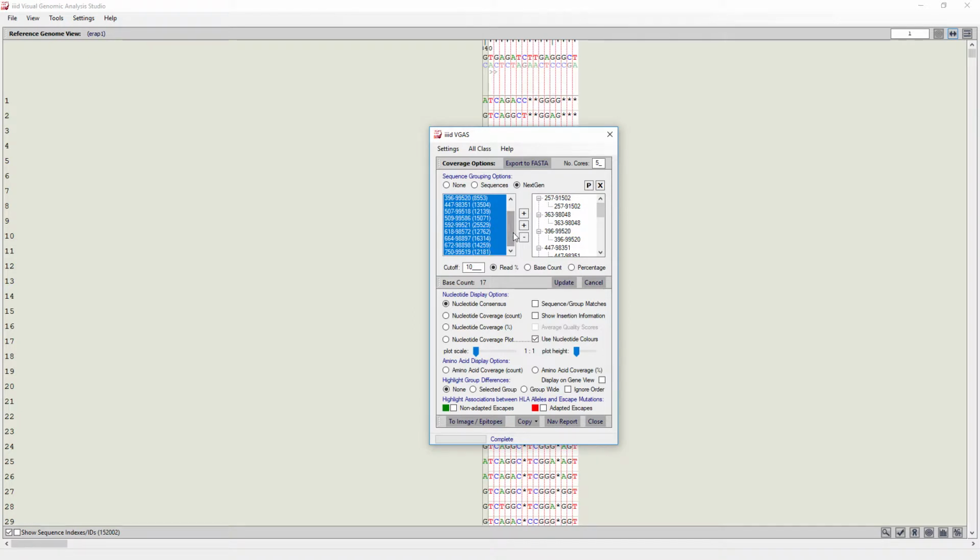However, please be aware that the nav report grid can only contain a certain number of columns, although this number is quite high. Therefore, if there are a large number of samples present, the samples may need to be separated into more than one report. Now click the Update button.